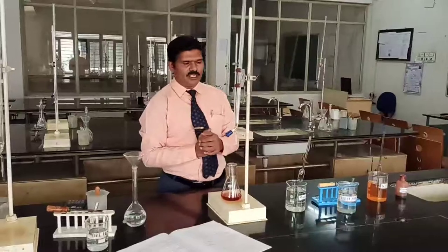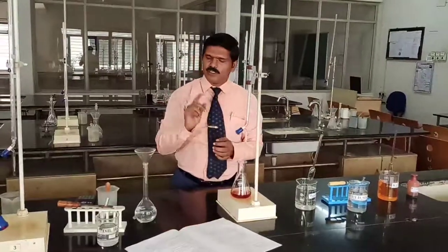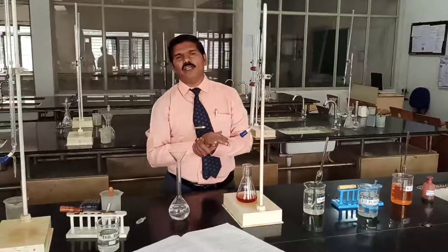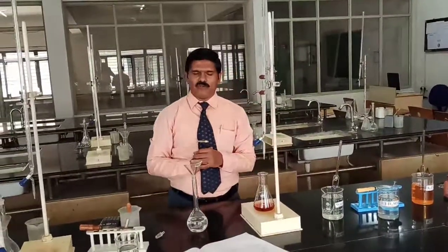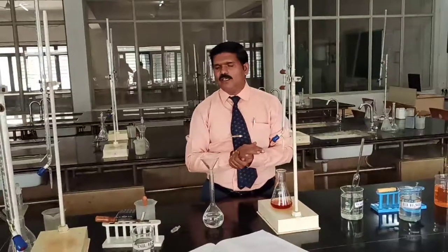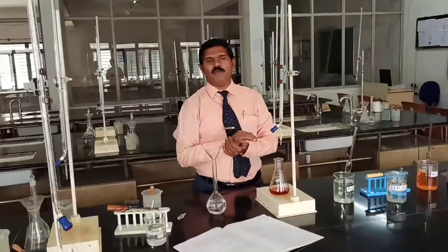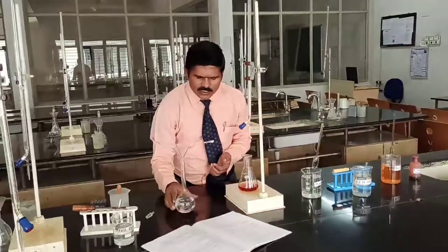In summary, to determine the COD of an industrial waste water sample: first, prepare a standard FAS solution of 250 cm³. In a 250 cm³ volumetric flask, weigh out ferrous ammonium sulfate crystals, transfer them into the flask, and add distilled water up to the 250 cm³ mark. Since you are dissolving a known weight in a known volume, you can calculate the normality of the solution.